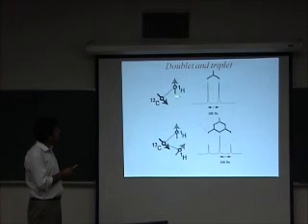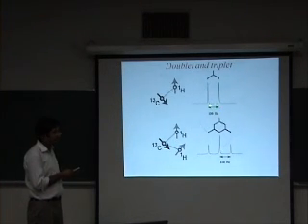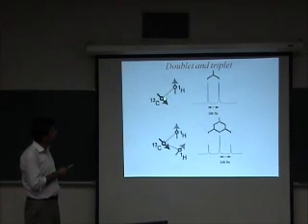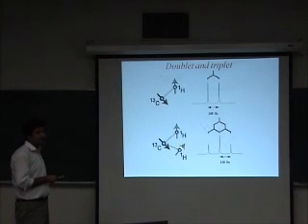So a single line is split up into a doublet, and the splitting of these lines, the horizontal axis of course is the frequency axis, so the splitting of these lines has units of frequency, and this splitting is typically of the order of 100 Hz, and this is called the amount of scalar coupling between the carbon-13 and the proton. Now suppose the carbon-13 nucleus is a part of a methylene group in which there are two protons.